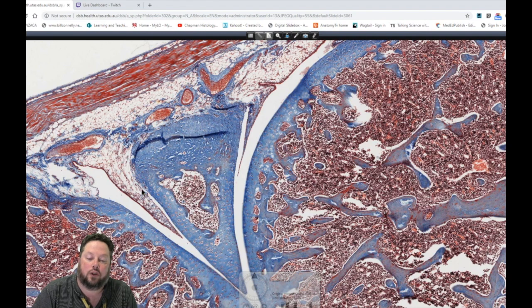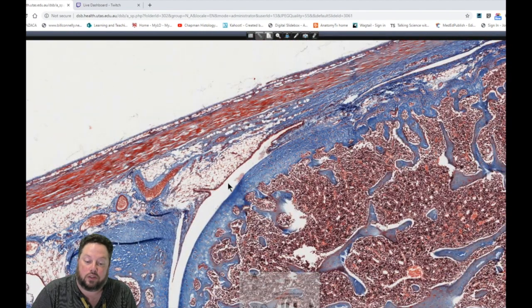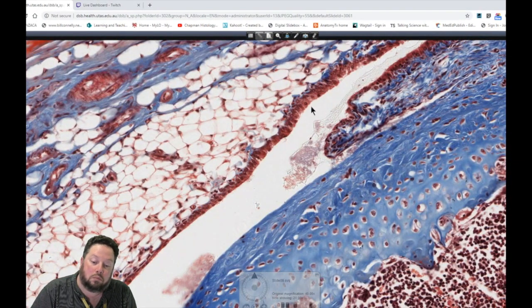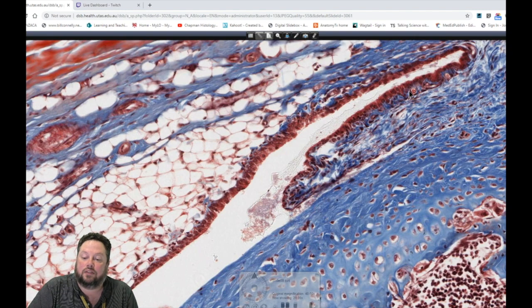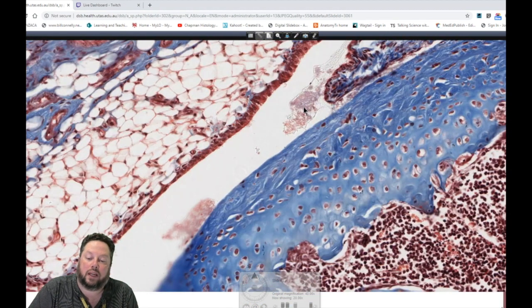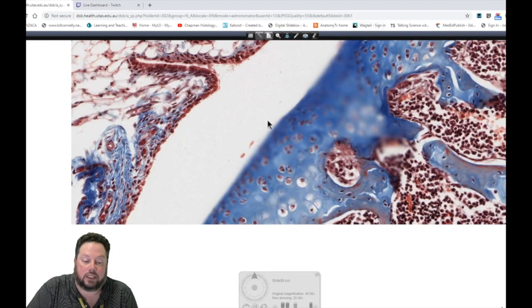And this is the synovial membrane. And there's another part of it here. You can actually see that it forms this enclosed cavity. So here's our joint cavity, here's our joint space. And this tissue here is the synovial membrane. The synovial membrane is a connective tissue layer that has lots of capillaries within it, and it provides the serum transudate, the plasma part of serum, into the space like this material here, and this bathes the surfaces and provides a diffusion medium through which we can supply nutrition and remove waste for our articular cartilage.